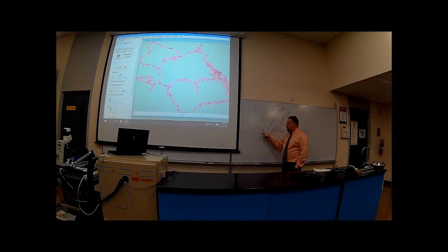And because this is so thin on the alveolus, the simple squamous epithelium, and you have simple squamous epithelium on the blood vessels of the capillary, it can easily pass through here and pass through here because it is so thin. And it's going to ride right onto the red blood cell. Perfect. You would expect that to be very thin, right? So that diffusion happens. A high dose of oxygen going from here to here, you expect to have simple squamous epithelium doing simple diffusion. Likewise, if we have, let's say, carbon dioxide, carbon dioxide is also going to be able to pass through thin layers like that to go out here so that you blow it off.